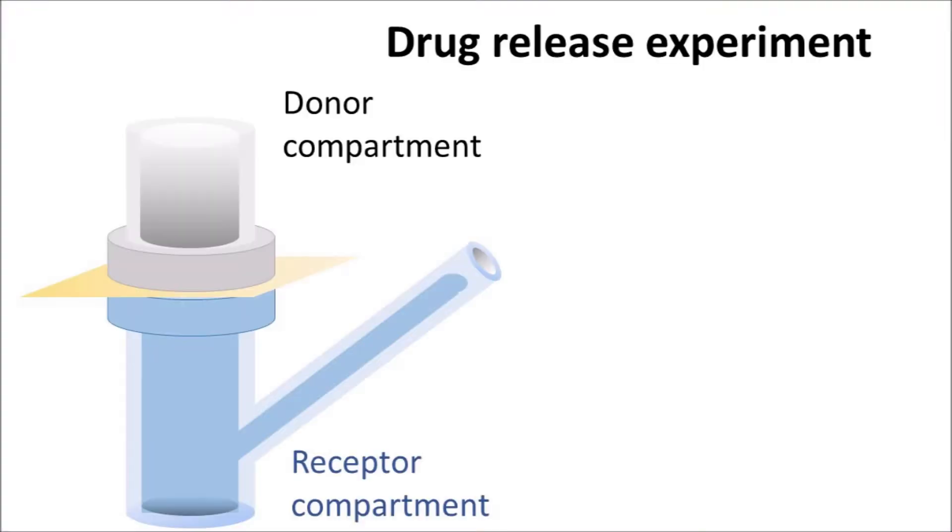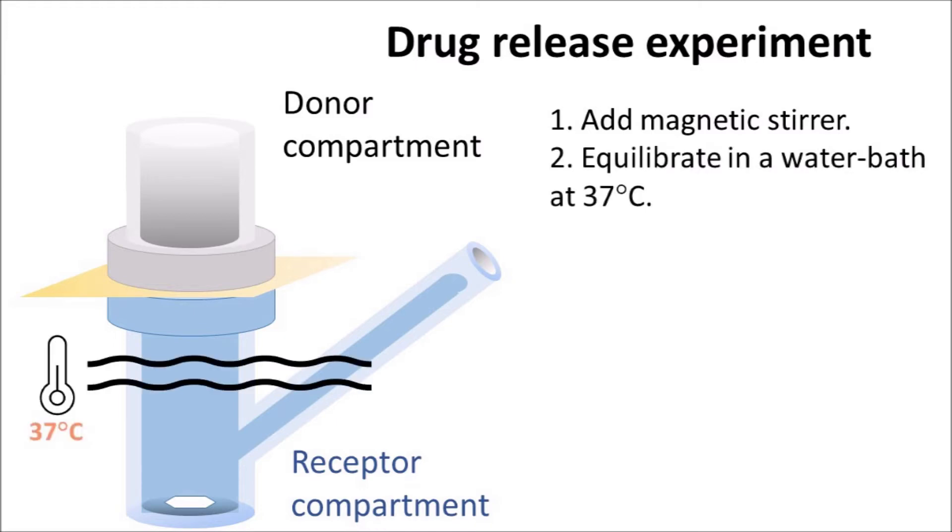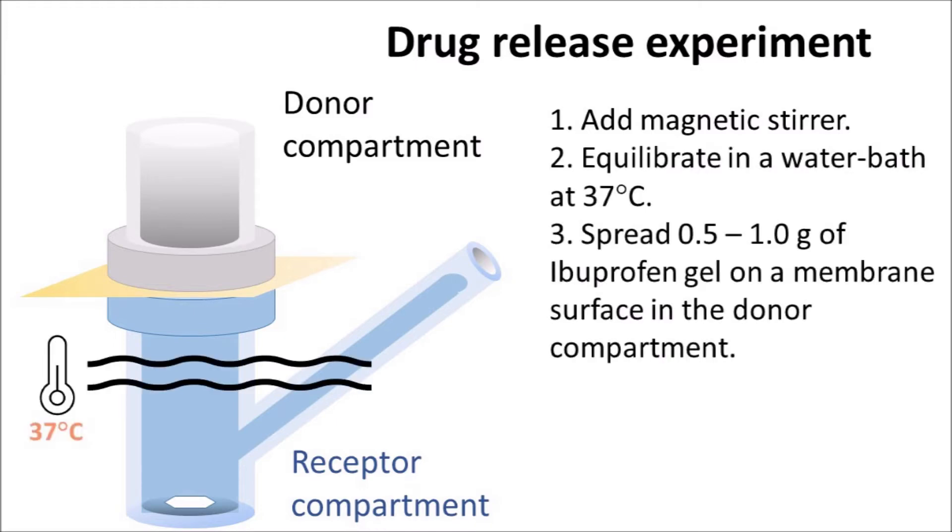Then for the experiment, we will add a magnetic stirrer and equilibrate the cell in the water bath.